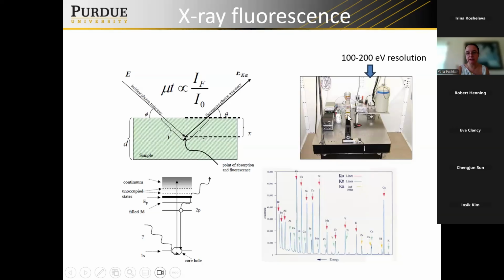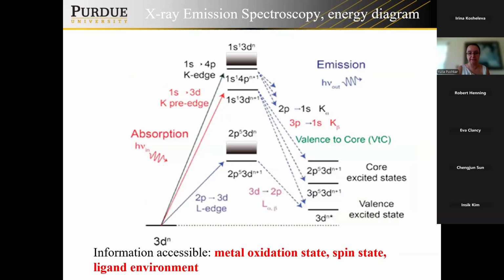And here you see a typical spectrometer, and its energy resolution is about 100 eV. So you remember the previous slide, we started talking 0.1 to 1 eV versus 100 eV. So with this device, you can record that fluorescent photon, but the broadening of the spectrum is significant. But still, you can do certain very useful analyses already there.